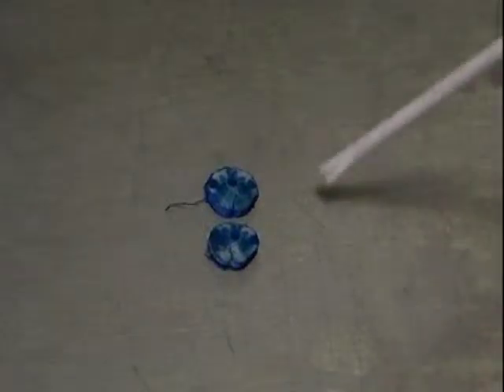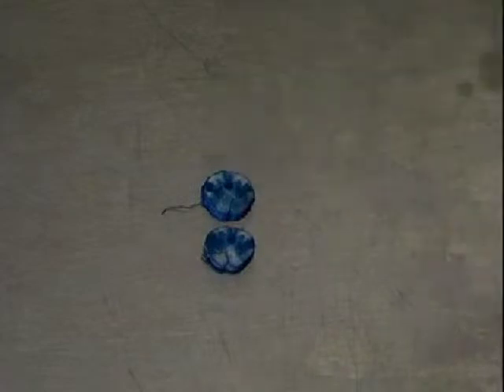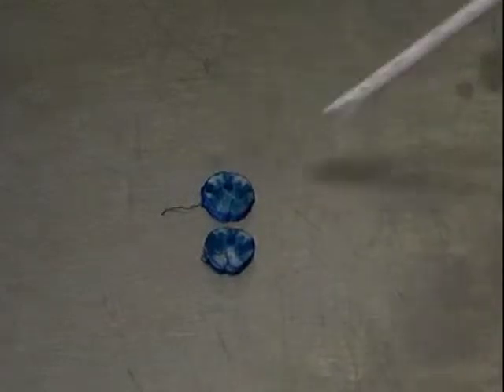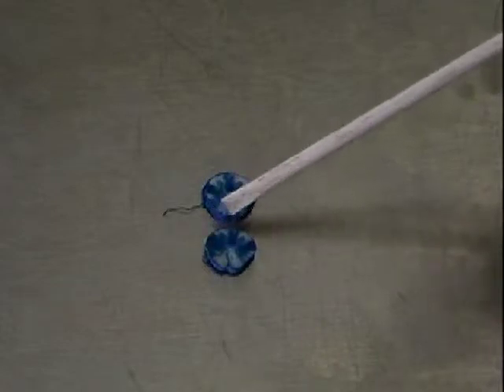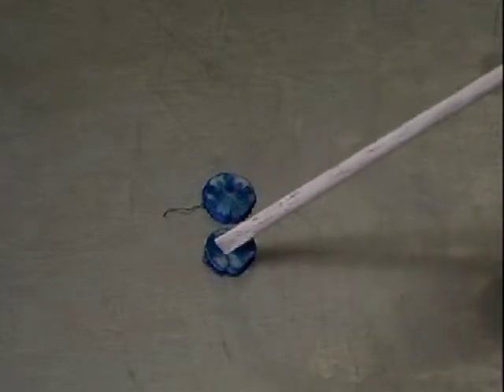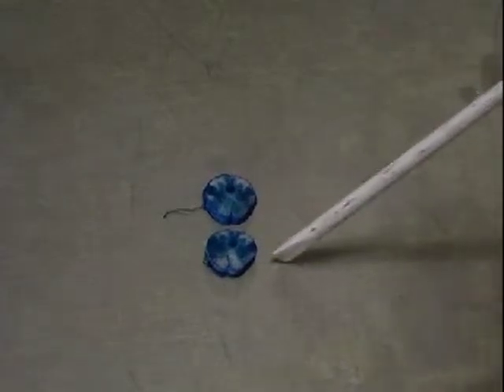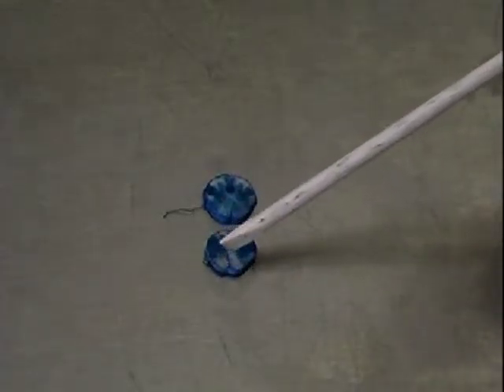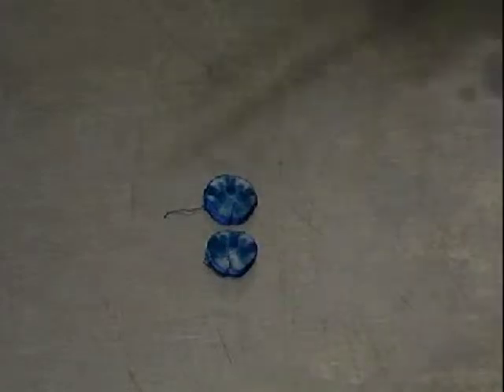Now when you do your brain cutting, you're going to cut a fresh brain, and you can see that these sections have been stained for cells. As you can see, the white areas here, unlike the sections we're using in class, are the myelinated pathways. This is pretty comparable to our level 1. You see this big white pathway down here. These fibers in here would be the pyramidal decussation.